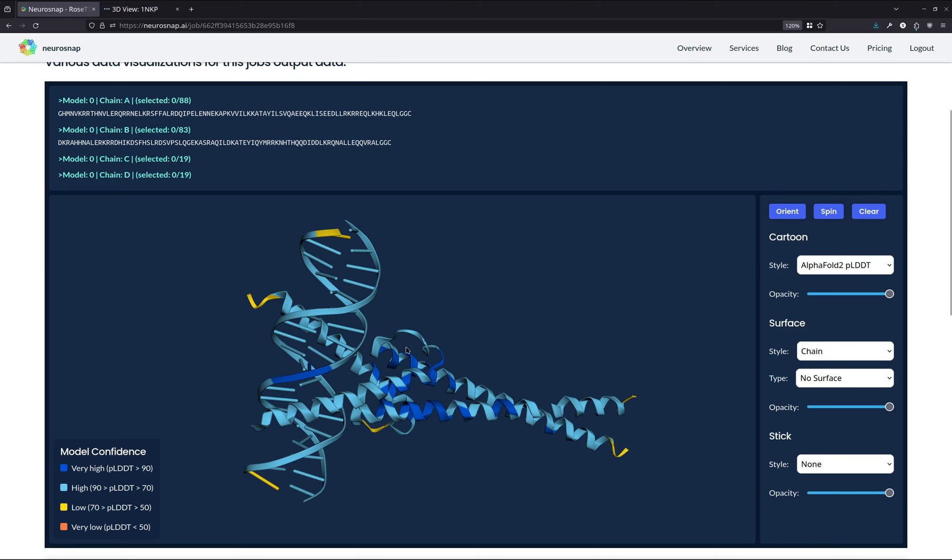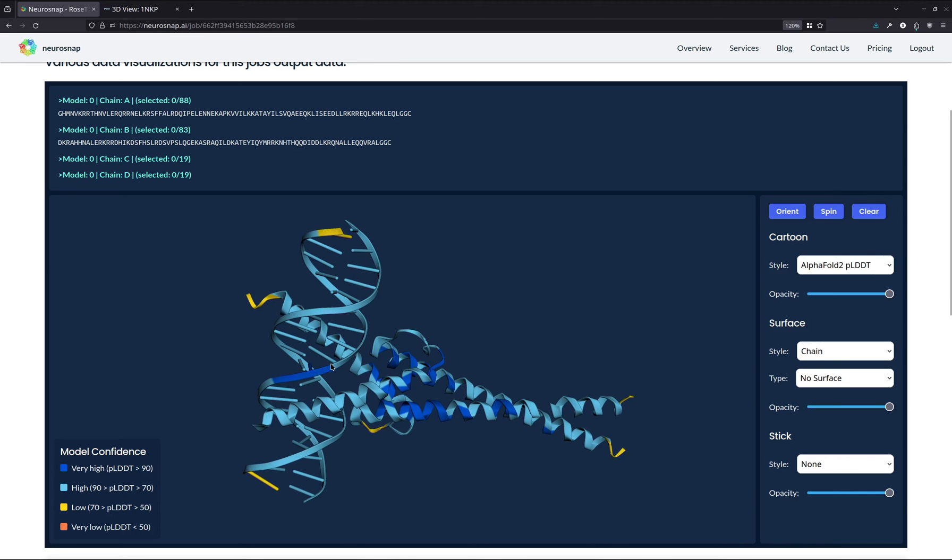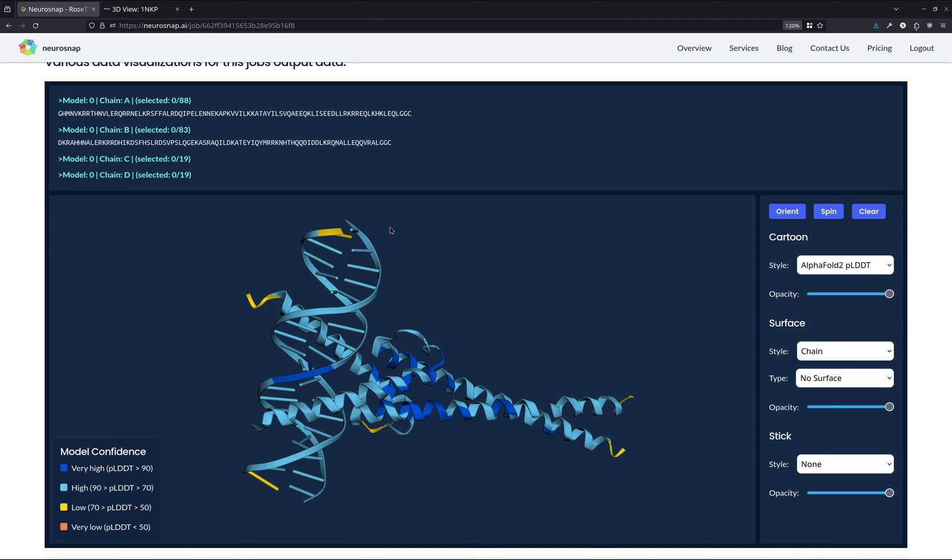Now, for those of you who are truly astute, you'll also notice that the nucleotides are also colored by PLDDT. So RosettaFold AllAtom also outputs a PLDDT score for molecules like nucleotides. And this is really fantastic because now we can use that to also assess the quality of the nucleotides within the structure as well.